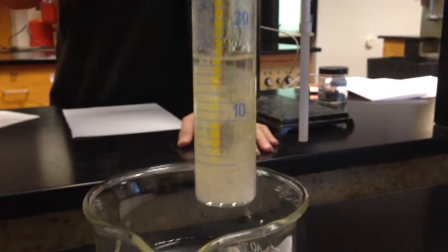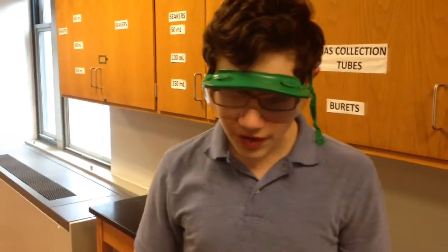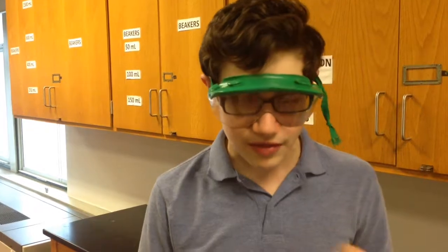This is what the crystallized KNO3 looks like. After we see our crystals, then we're going to do the experiment again, but each time with 3 extra milliliters of water, which we will measure out in our 10 milliliter graduated cylinder. After we've added 3 extra milliliters of water, we'll place the KNO3 solution back onto the hot plate until it's dissolved once again, and then we will put it back into the cold bath until crystals form again, and do that many more times for as many trials as you want.